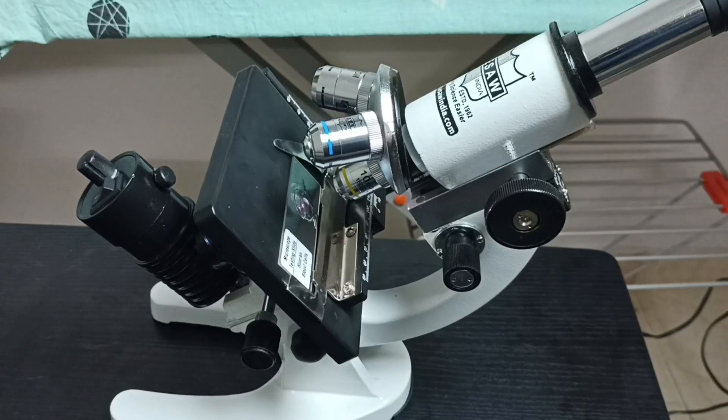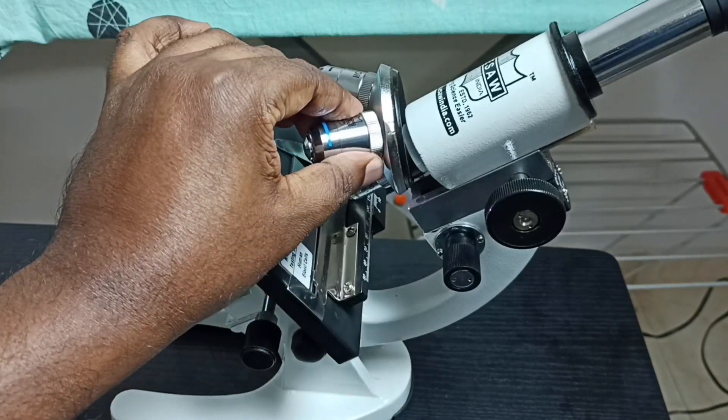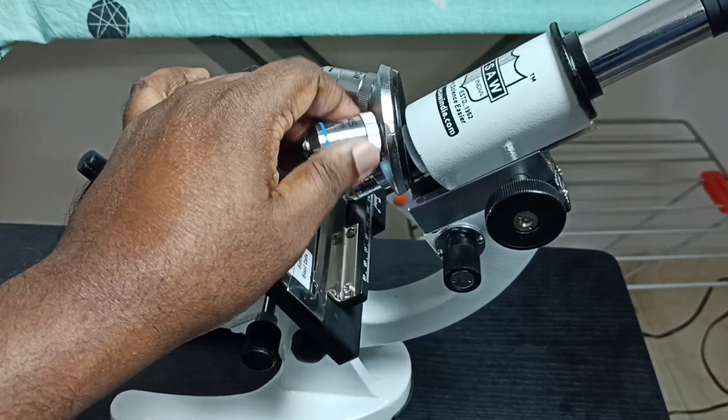Hi friends, this video shows how to clean the objective lens of a microscope. I am going to clean this objective lens — first let me remove this objective lens from this microscope.